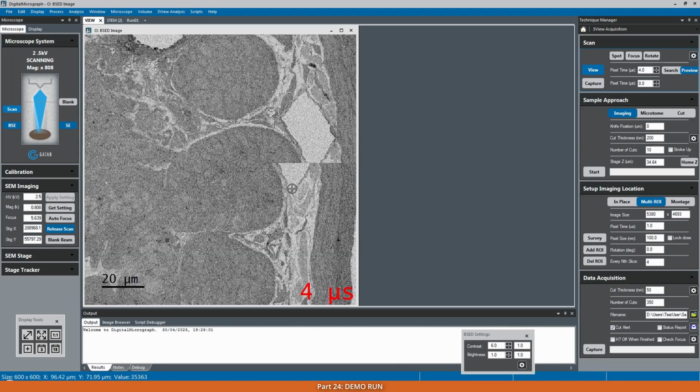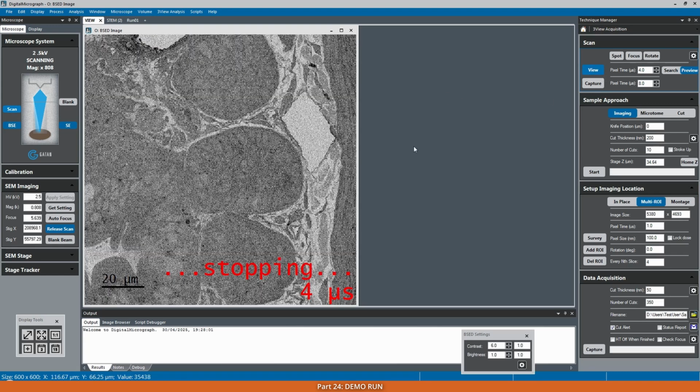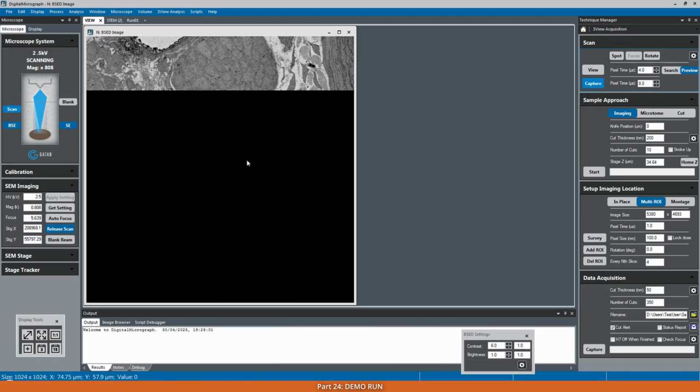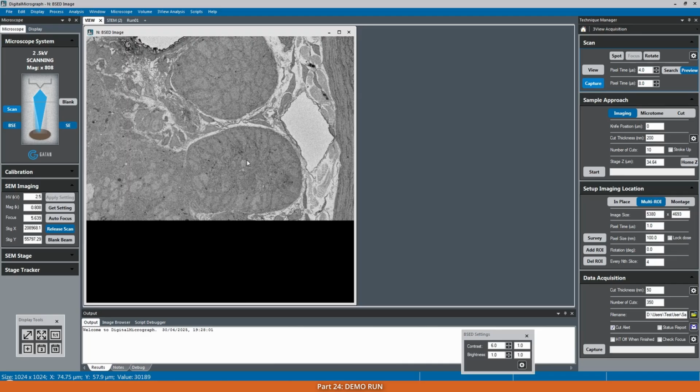In this case, we'd like to take the script. Let's have this view, this magnification, for our overview. We can change the parameters for the overview. Now it's 1K by 1K, and then I hit capture to take a snapshot. So the snapshot is taken.